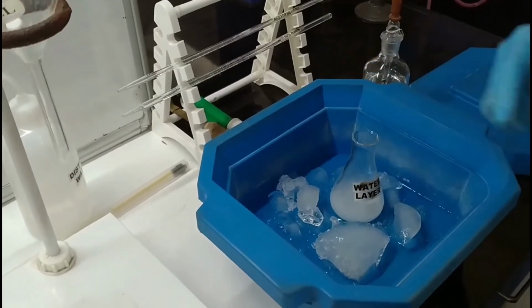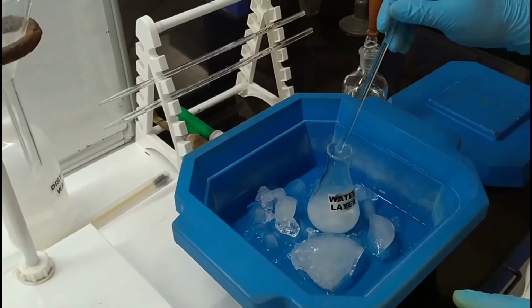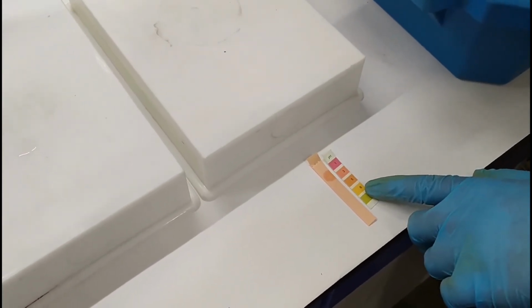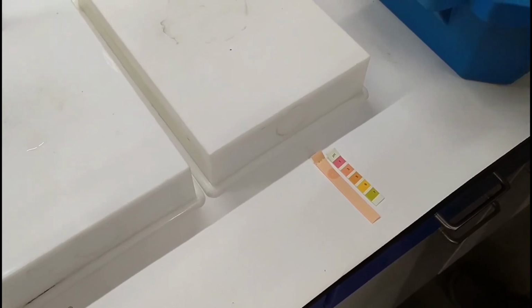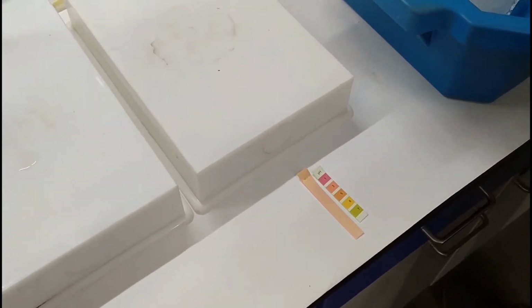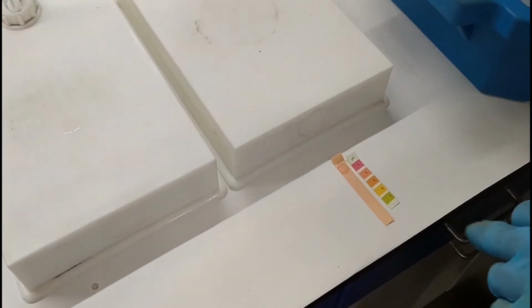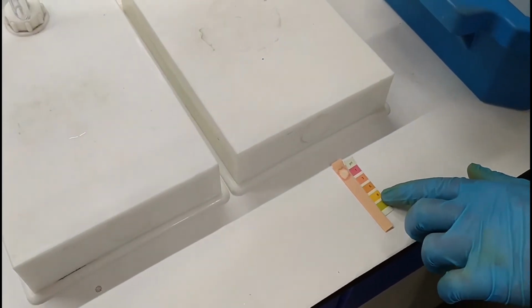We have to check whether the pH of the solution has reached below 3 or not. So I am going to check the pH. Below 3 means it needs a little bit more acid. See, it is now below 3.